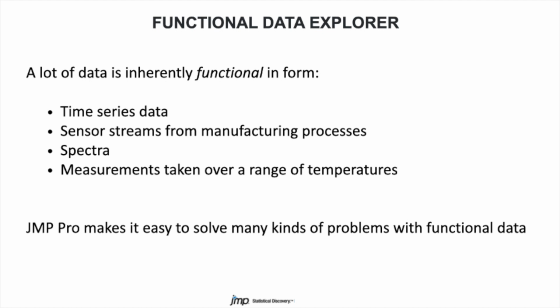And there's a lot of other examples, like DOEs where you're taking measurements over a range of temperatures or at a range of pHs or whatnot. There's a lot of different kinds of functional data out there, and we've worked pretty hard to make it a lot easier to analyze this kind of data.